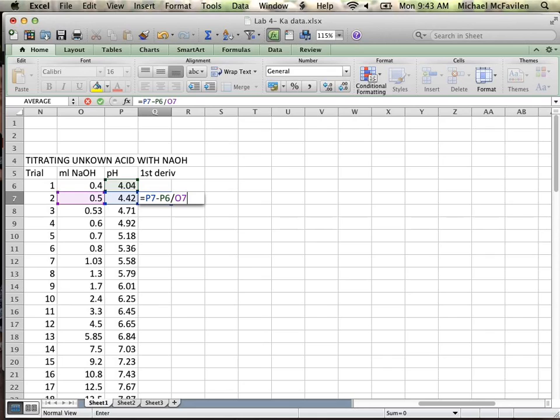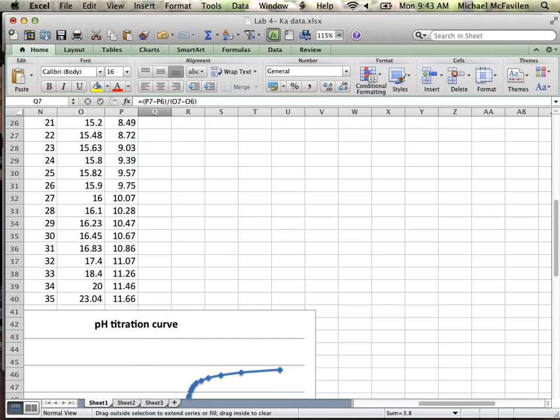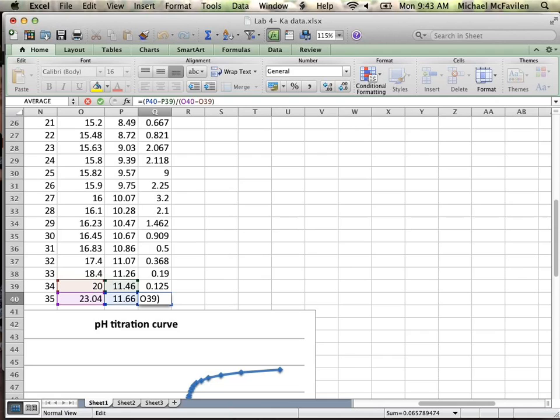It's our volume. If we went through and just entered it as is, we're going to get some pretty awful numbers. Okay, why? Order of operations. We need to make sure we get our parentheses in there to make sure Excel knows how to calculate. Whoops. Okay, so this will give us the slope of our line. We can click and drag and have Excel calculate that all the way down. We'll check just to make sure it's doing it right. Yes, it's still calculating the last two values.